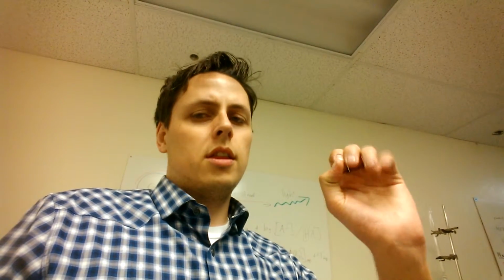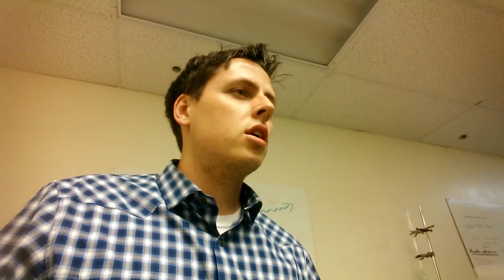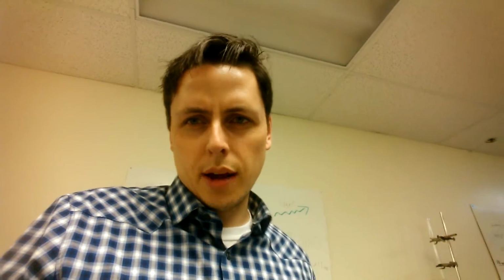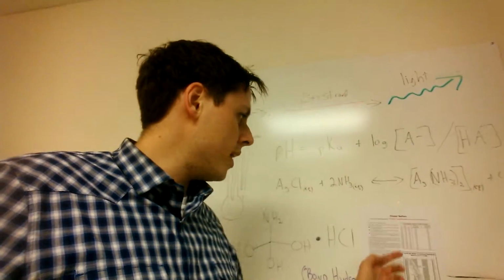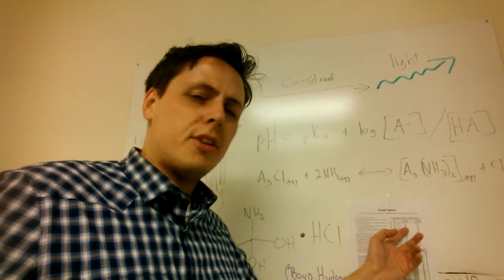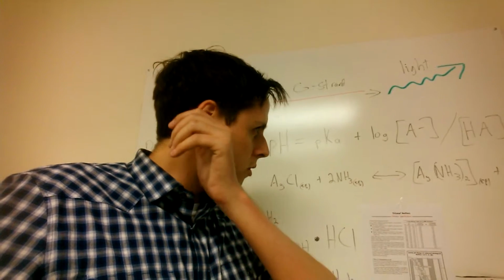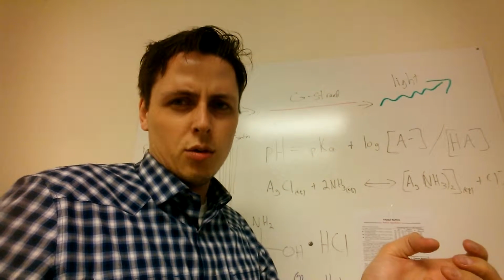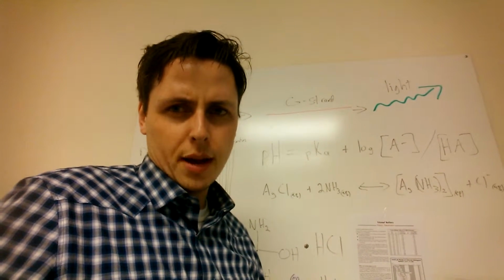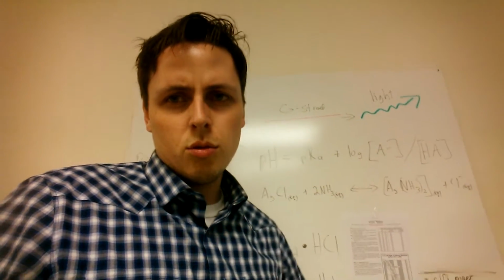One of the small troubles with that is that the powders themselves will be contaminated by water. You've got water in the air, humidity, which will go into those powders and make them slightly heavier. So if you're trying to weigh out a particular number of grams here, part of that will be water, so you'll get the wrong weight. So if you're not desiccating, meaning drying, where you can use something to pull the water out of the powder, and I don't happen to do that, you need to use a pH meter to figure out the right pH.